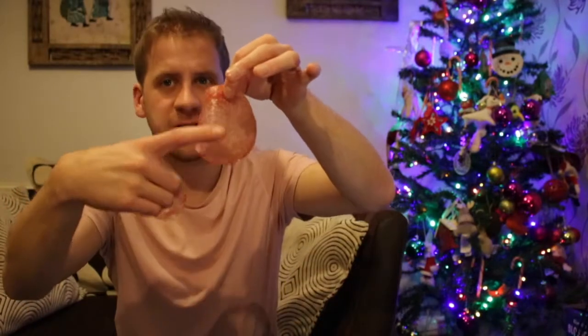I need to put this away before the dogs go absolutely mental. Hungary salami — if that's how you say it. If that's not how you say it, please tell me how you say it. This one's more thin and a bit transparent, a different sort of structure. This one has loads of big chunks of fat in it, whereas the other one had tiny bits of fat all the way through. This one's got quite big bits where there's no fat and then big bits where there is fat, while the other was a more uniform sort of small bits of fat everywhere.